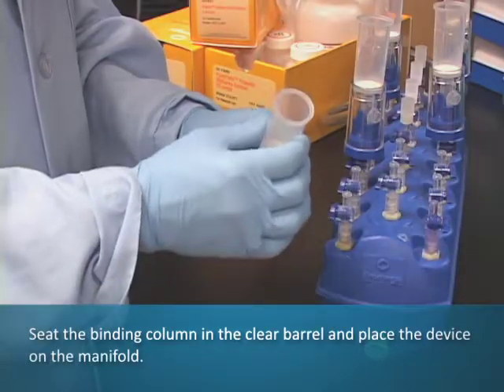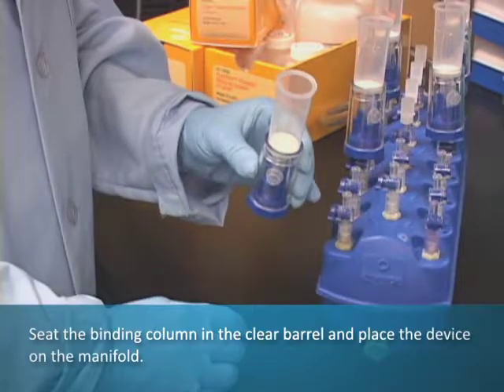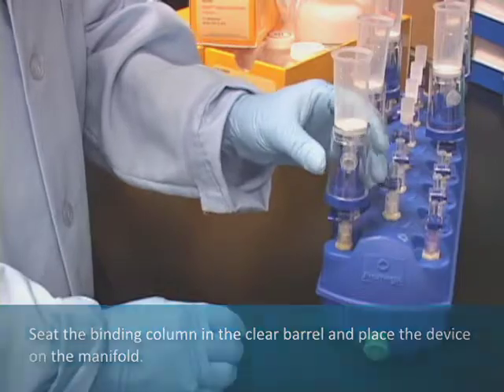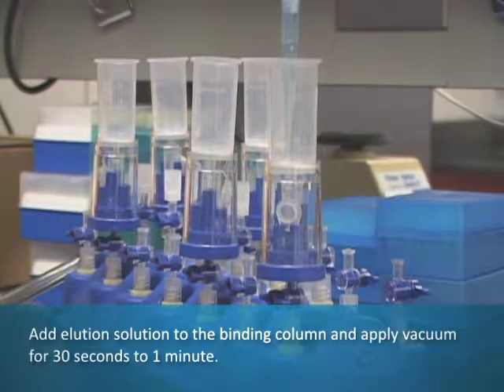After samples are applied to the PureYield column and washed, the column is seated in the clear barrel of the Eluator. The Eluator is then placed on a vacuum manifold with a luer lock connector. Elution solution is added to the column and vacuum applied for 30 seconds to 1 minute.